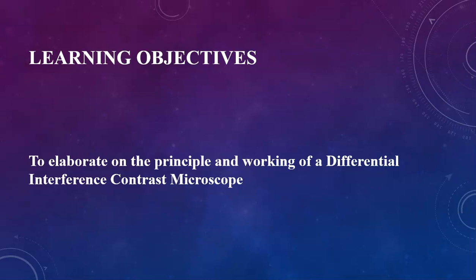So just a brief review. Till now we had learnt about the basics of light, that is the light properties. In the very first video lecture, we learnt about the basic properties of light, what is meant by a lens. We learnt about the description of reflection, refraction. Then in the initial topics and video lectures, we learnt about bright field, dark field, phase contrast.